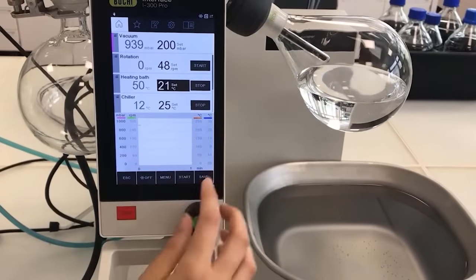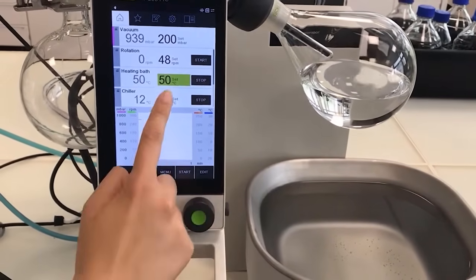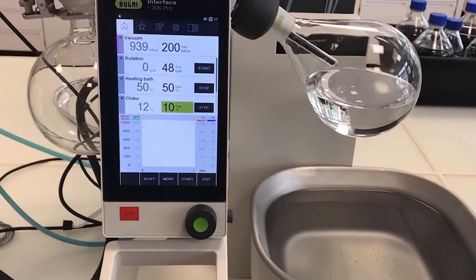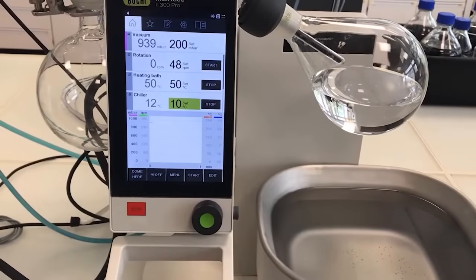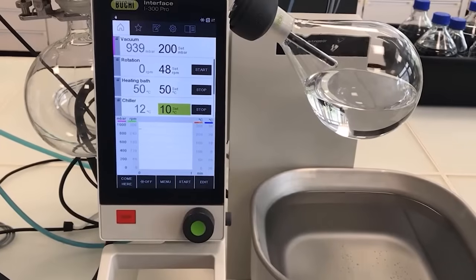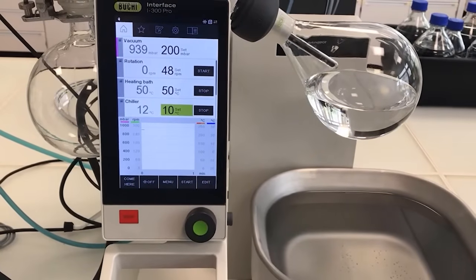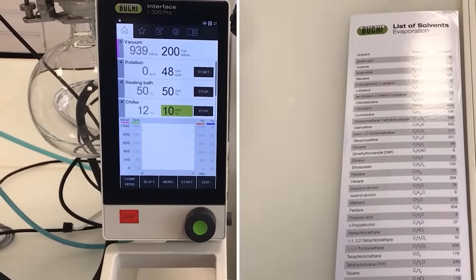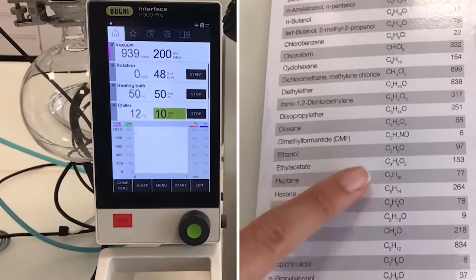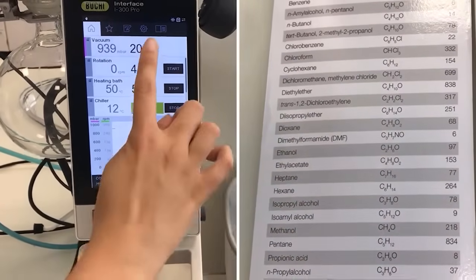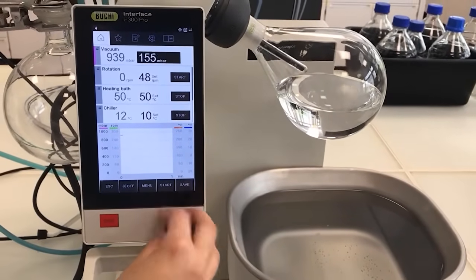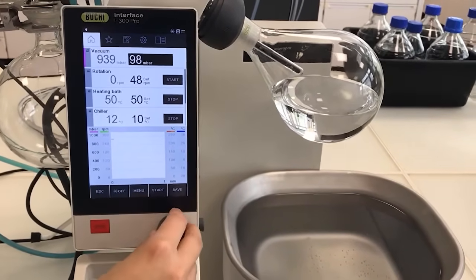We will set the heating temperature to 50 degrees and the cooling temperature to 10 degrees. Next comes the pressure. Since we target a vapor temperature of around 30 degrees, we look up the pressure values for ethanol at that particular boiling point in the solvent table. As you can see, the desired pressure should be at 97 millibars, so we go to our interface and set the pressure to 97 millibars.